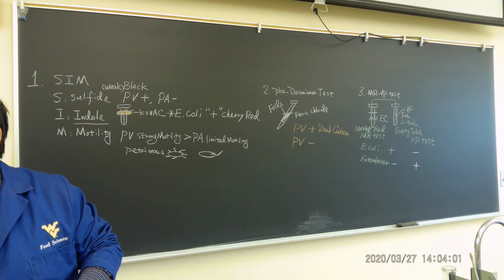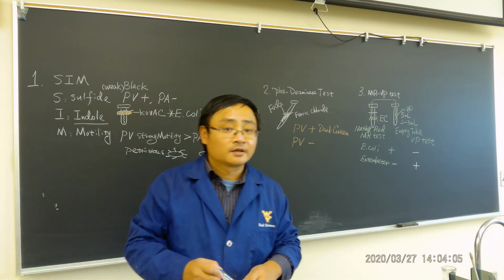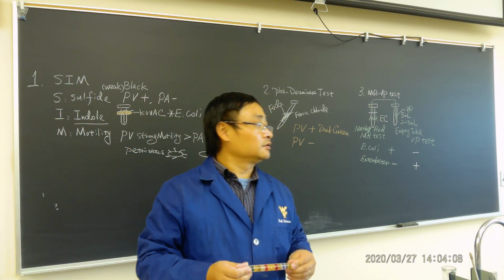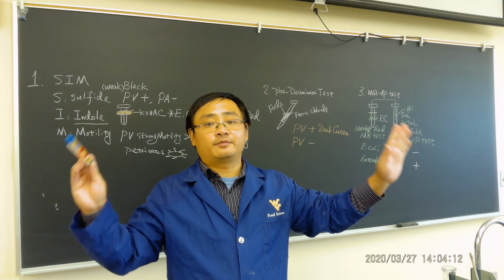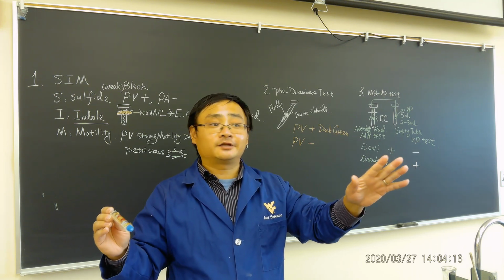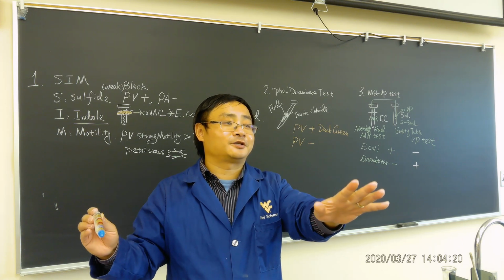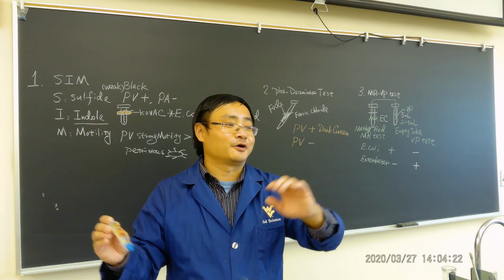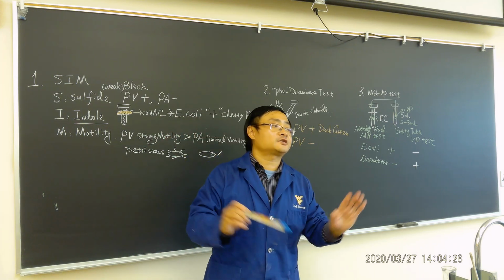That's what I did. No worry, you can have one. Okay, so first of all, compare. Is there any difference? If no difference, that means you guys did good. If any difference, which means you have a red, then you have a yellow, that means you got a contamination. So that's the way to test your contamination. Okay, very, very simple. So just compare, okay?